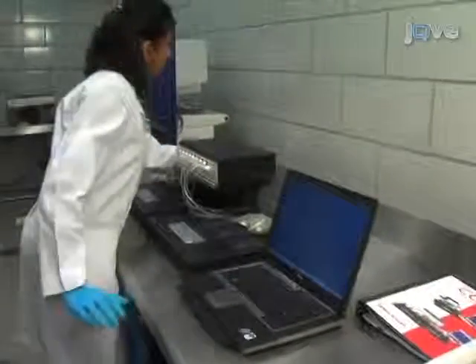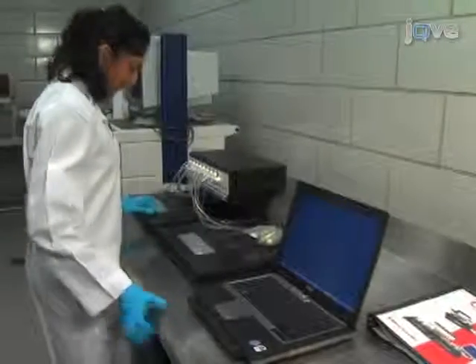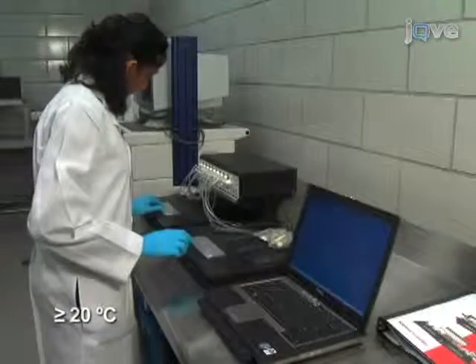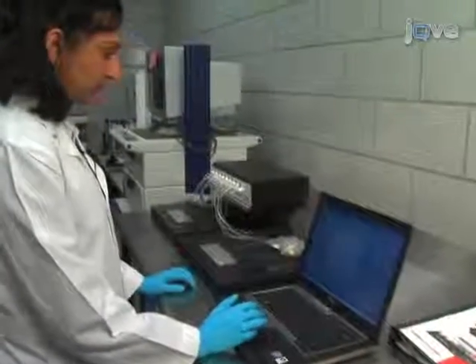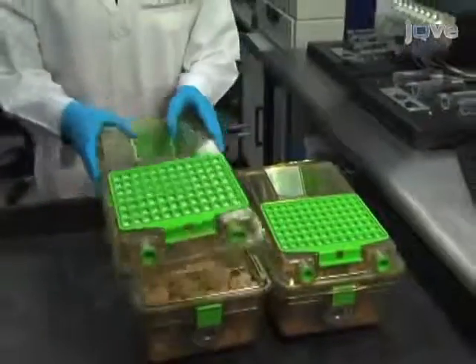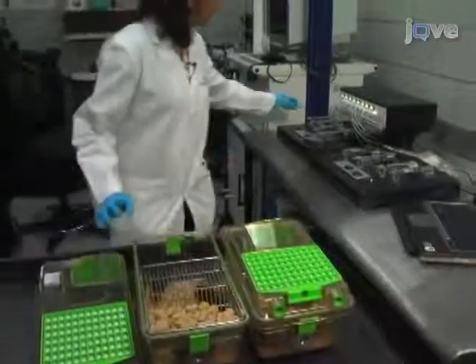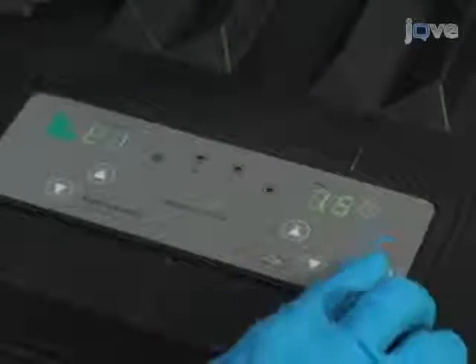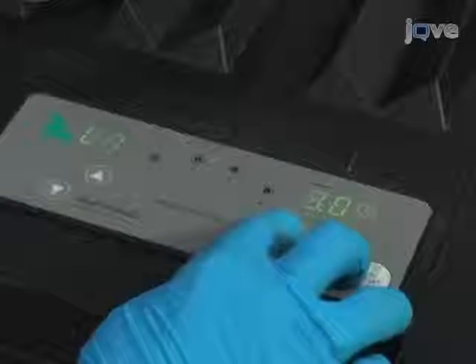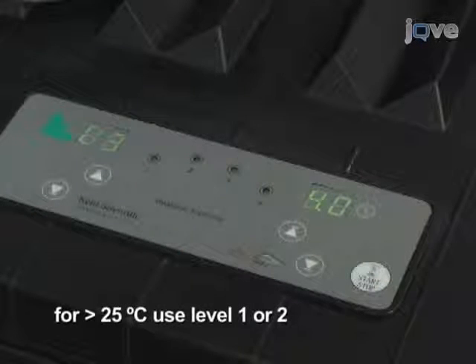To set up the CODA system, select an area in the lab where the room temperature is a stable 20 degrees Celsius or above. Avoid locations near air conditioning vents. Exposing animals to loud noise or odors may irritate or stress the animal — odors can include any strong perfume you may be wearing. Turn on the CODA controller and then warming platforms, which are set to level 3. If the room temperature is above 25 degrees Celsius, start at levels 1 or 2.